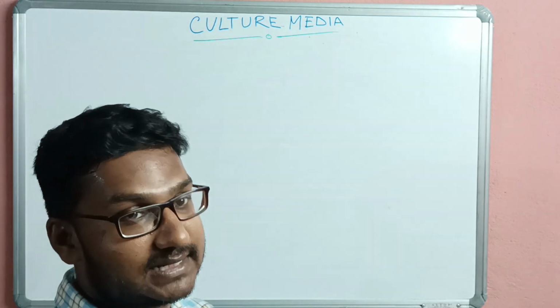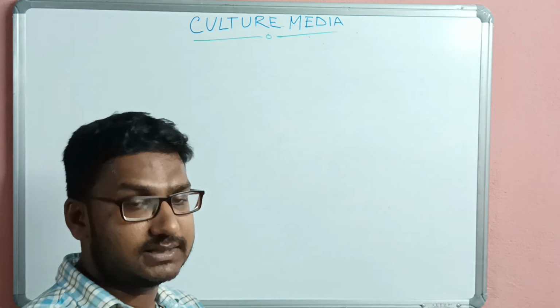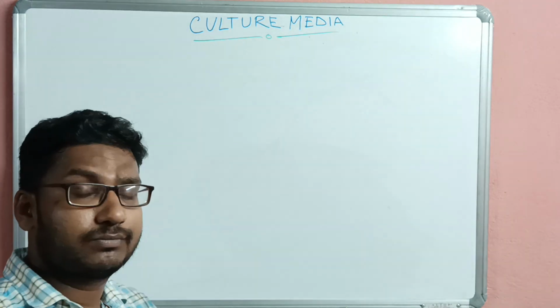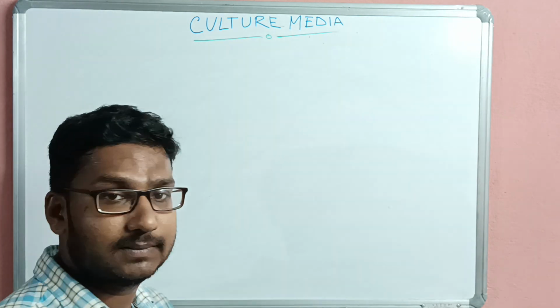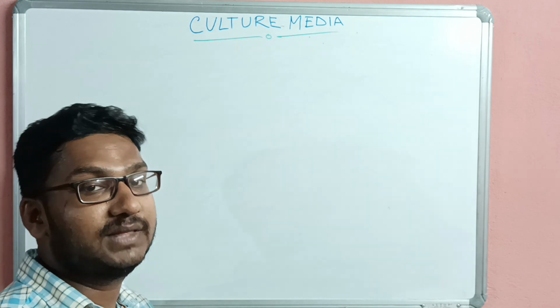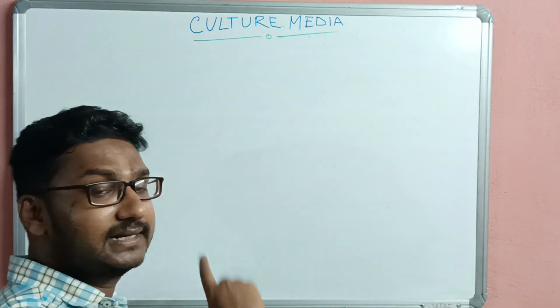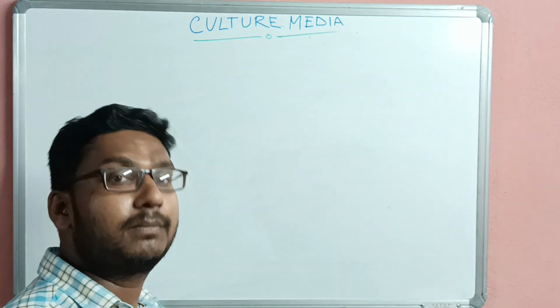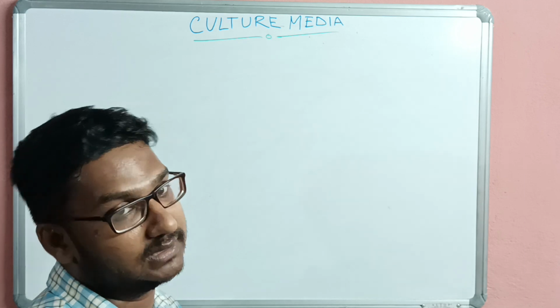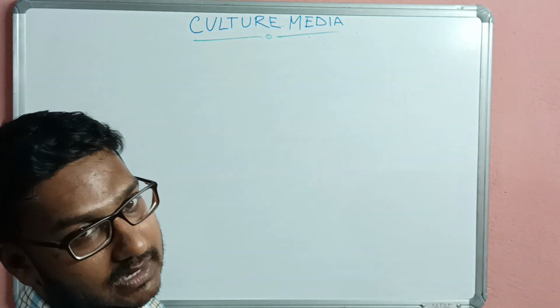Today we are going to discuss the culture media. So what is culture media? It is a nutritive material generally used for the growth of bacteria in our laboratory.